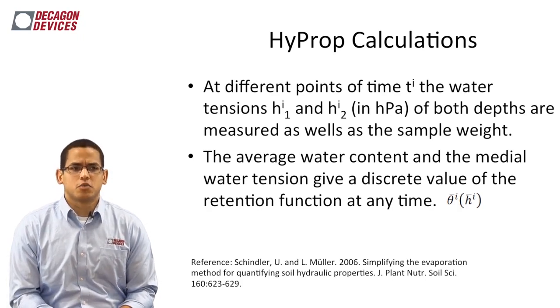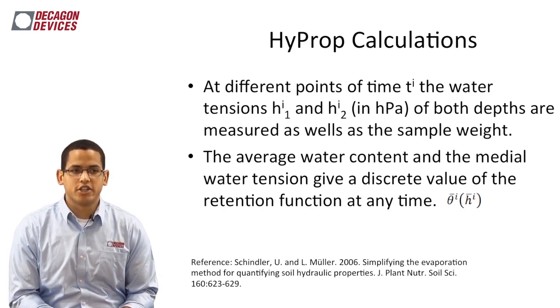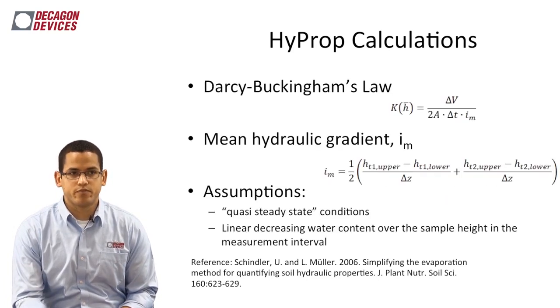And just to reference where a lot of the work that goes into this technique came from, there's a good publication by Uwe Schindler and L. Mueller from 2006 titled "Simplifying the Evaporation Method for Quantifying Soil Hydraulic Properties." So if you want a good read on the evaporation method, that's a great publication to look into.